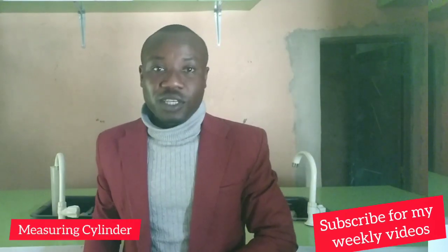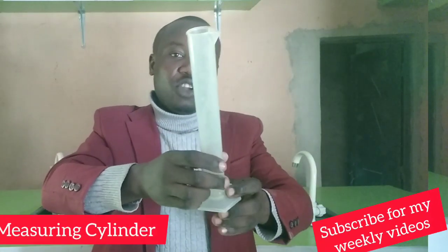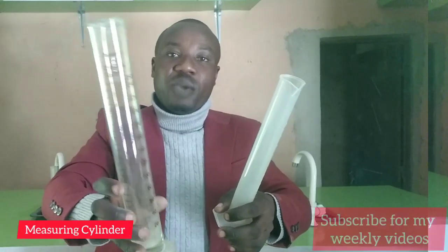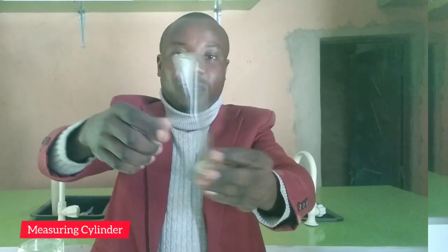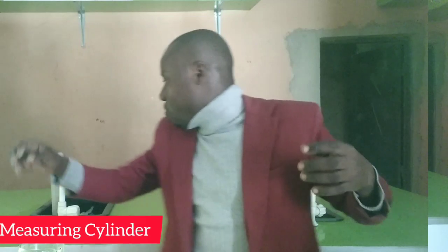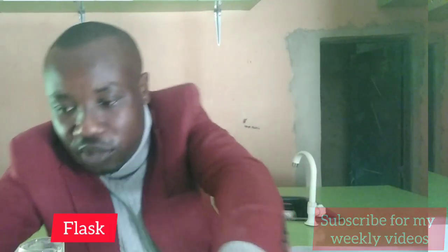Now let me show you some of the measuring cylinders. We have different measuring cylinders, just as I told you in my previous class. Some are made of plastic. This measuring cylinder is made of plastic, 100 ml. This other one is made of glass, 250 ml. They have different sizes. This one is 10 ml. We have a bigger one, 250 ml, and one bigger than that, made of plastic as well, about 500 ml.